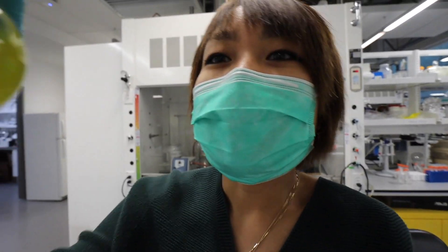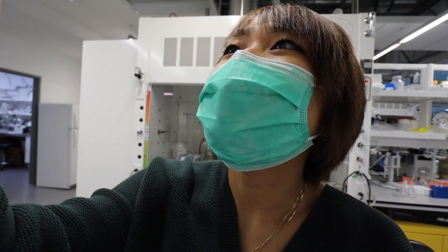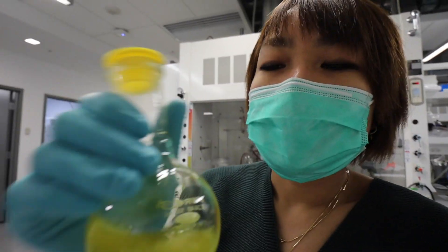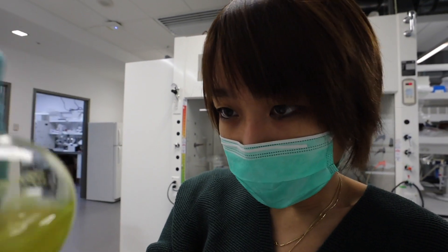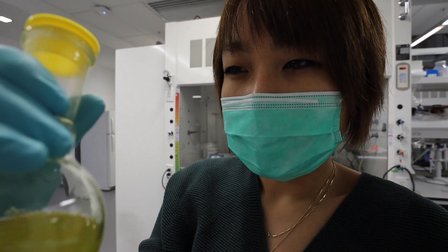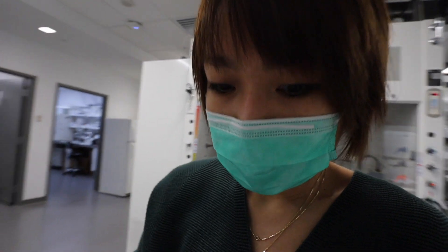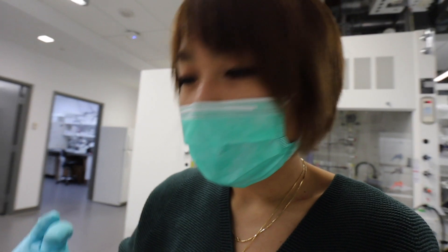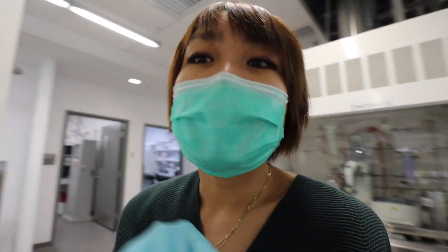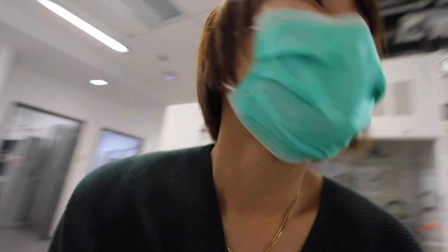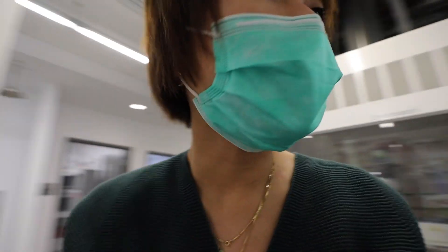I think first I'm gonna evaporate all the solvent so that it's more concentrated because right now it's THF and water. So evaporate it, put it back into DCM, and then I can run a TLC to see how much approximately product I have or how much conversion happens, and then I'll prepare for the column. It's coming back to me, it's coming back to me.